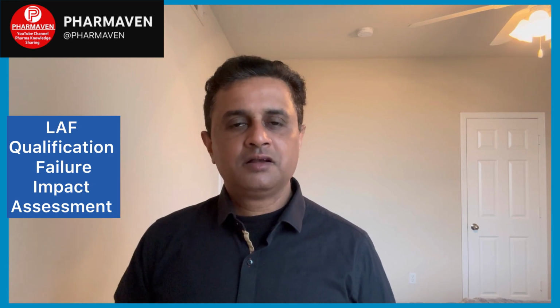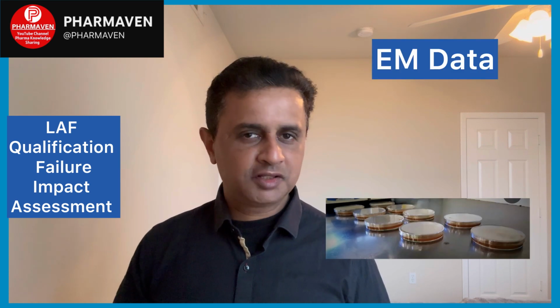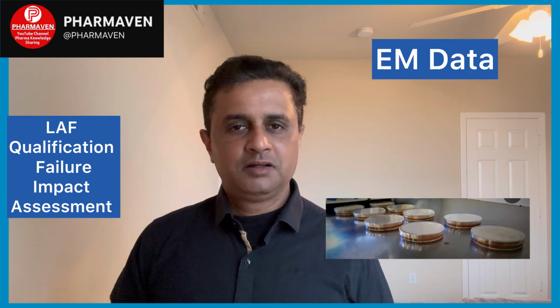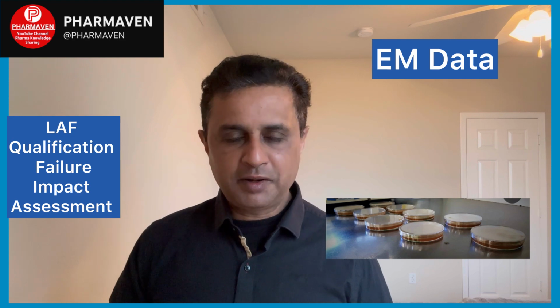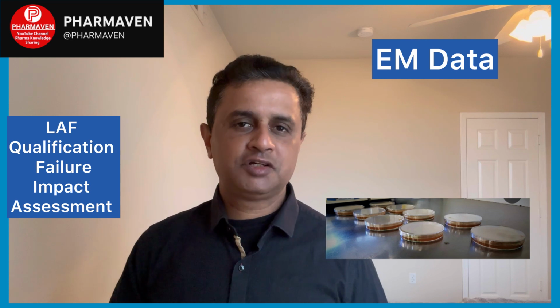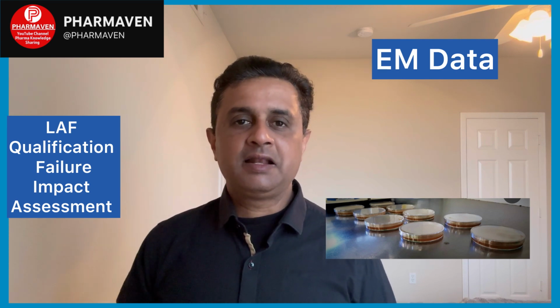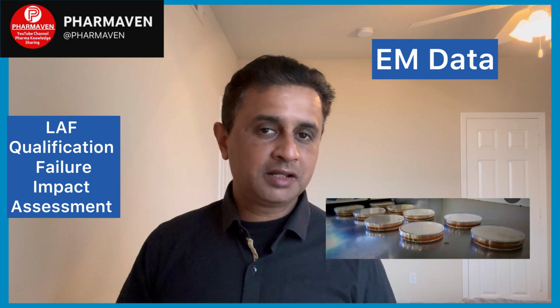Third thing, review the environmental monitoring data for that specific filter, mainly viable particle counts and non-viable particle counts. Review all the previous batches' environmental monitoring data to understand whether there was any problem, any shift in the trend, any excursions, or results within the limit but not as per the trend.